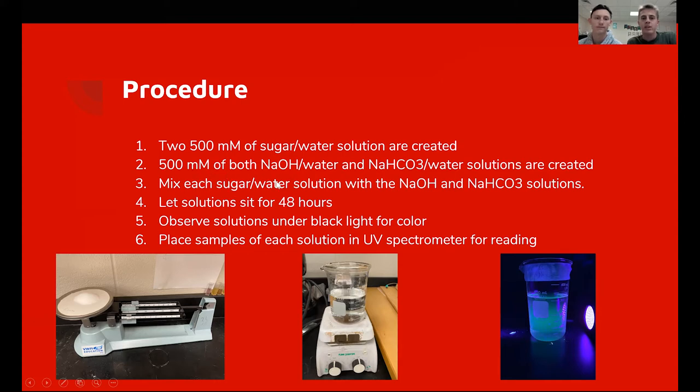And then we take each of these solutions, the sodium hydroxide and sodium bicarbonate, and we mix them with the two sugar water solutions. So then we let these solutions sit for two hours or 48 hours.